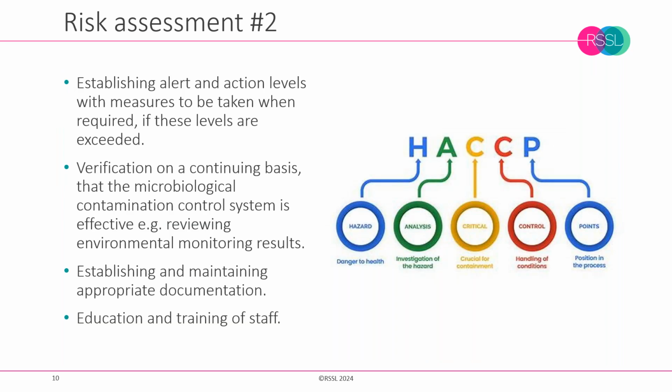It's also important for us to establish alert and action levels, and to map out, where possible, the most suitable types of actions that we should take when these limits are exceeded, or we start to see an out of trend situation develop.